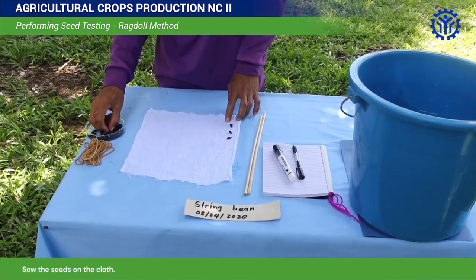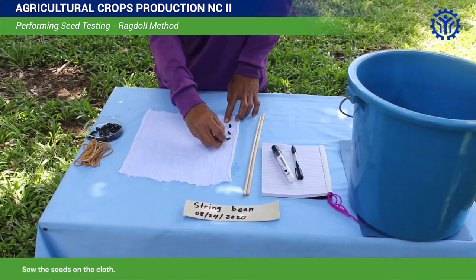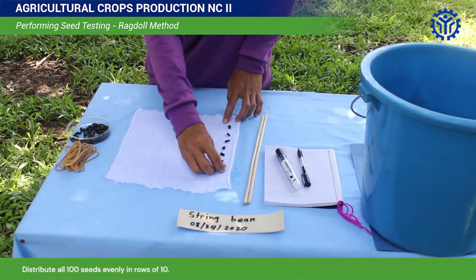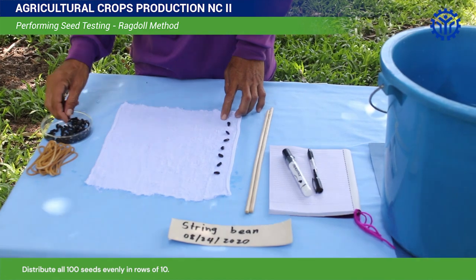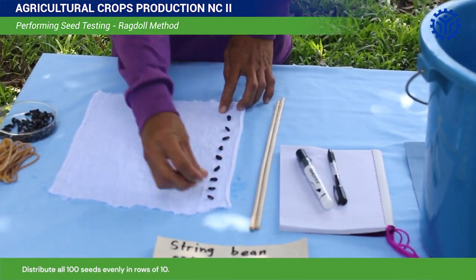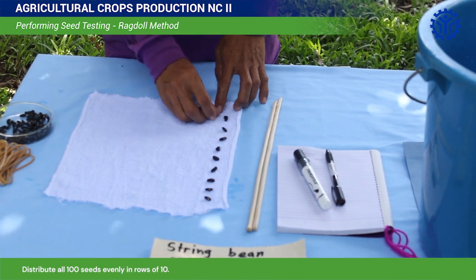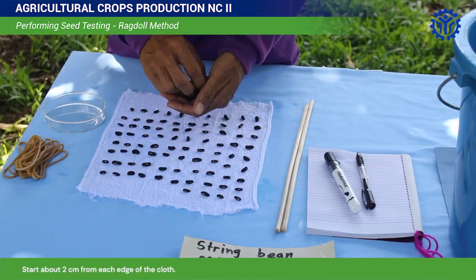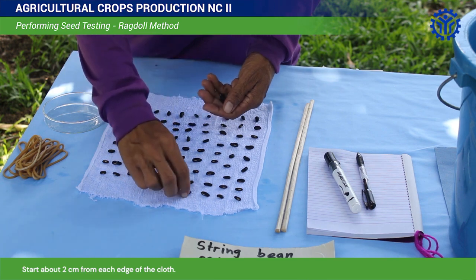Sow the seeds on the cloth. Distribute all 100 seeds evenly in rows of 10, starting about 2 cm from the edges of the cloth.